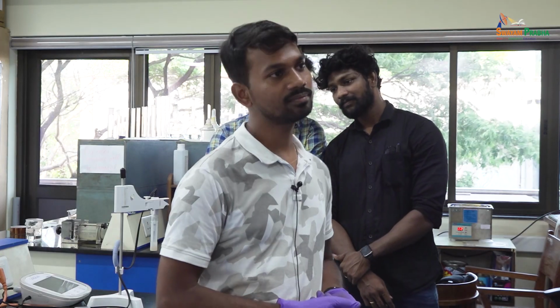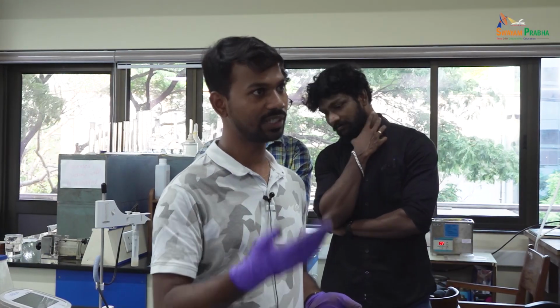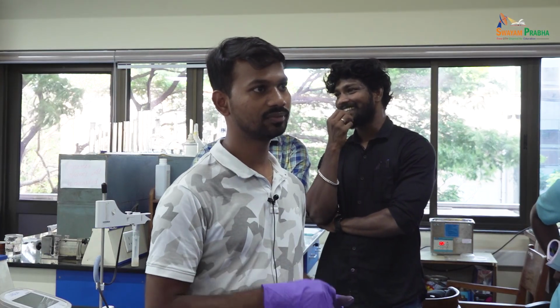When the PDP itself is closely varying, can the same current be observed in EIS? No, it will give you the resistance value only, so precisely we can't. Here we can control the scan rate. Now I am using 10 millivolts per second. If you need more precision, you can reduce the scan rate, for example to 0.1 millivolts per second.